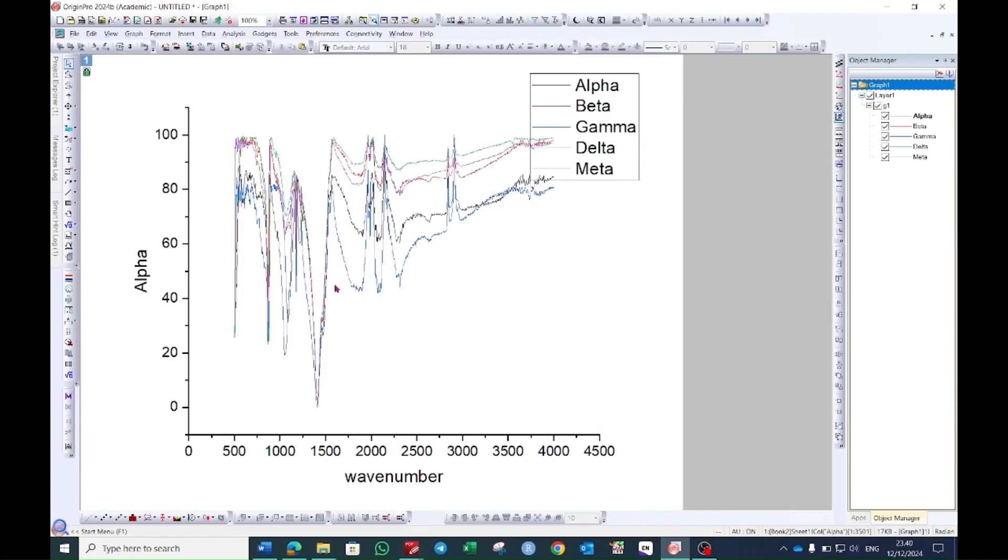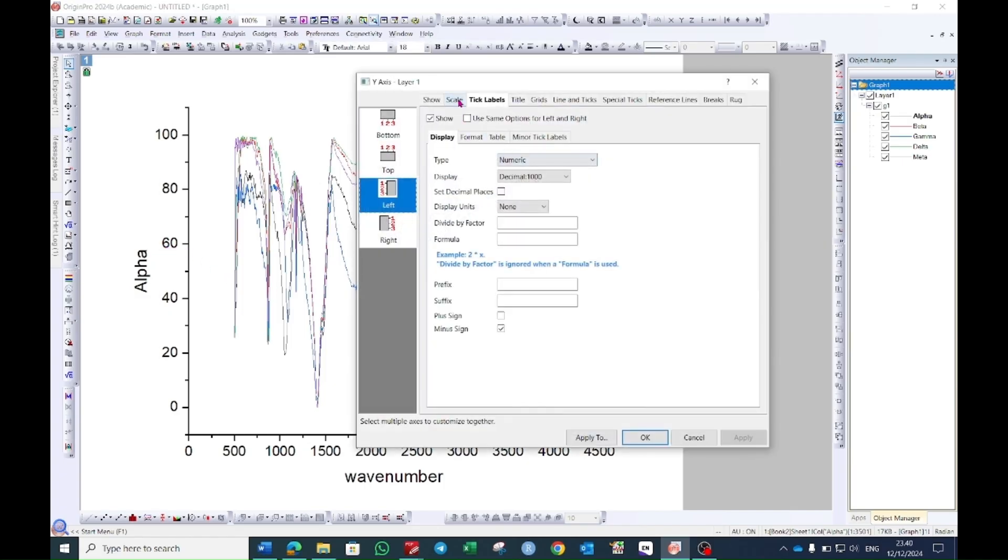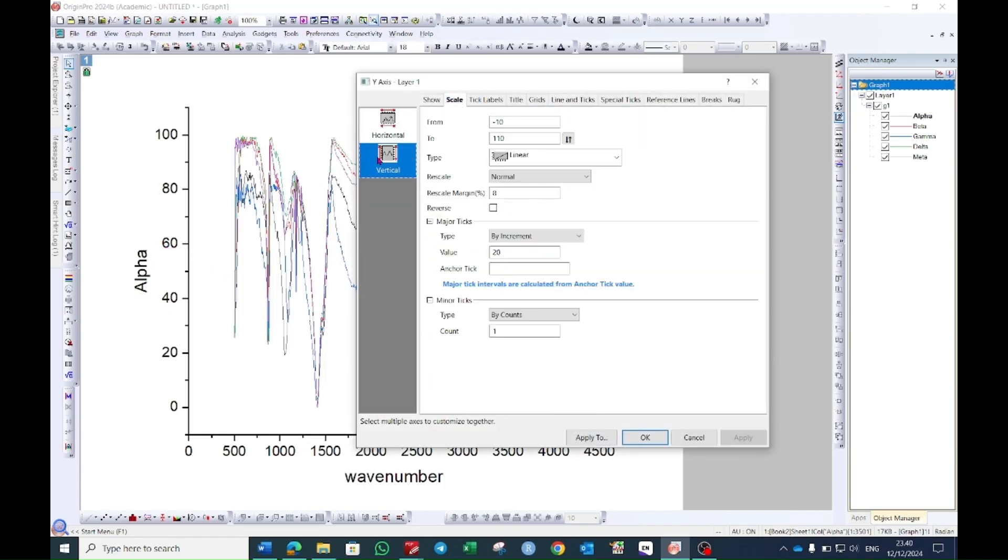To make this graph look professional double click on the y-axis. Go to the scale option. From vertical choose from minus 10 to 700. You can change this value according to your data.